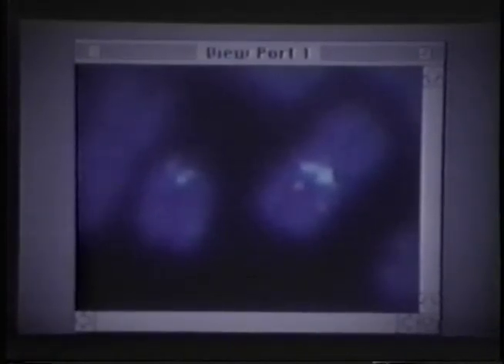This is an example of the application of this in metaphase. This is an ovarian cancer, short-term culture of an ovarian cancer, and we're looking here at chromosome 3. We're using a probe for the centromere of chromosome 3 and also a probe for the mid-short arm of chromosome 3. And what you can see here is that we have a normal chromosome here. Here you can see we've lost the entire short arm of chromosome 3, and we've lost that probe that goes along with it. This would be fairly easy to pick up even using conventional cytogenetics. What's important is that we can also pick it up in interphase without culturing the cells at all.